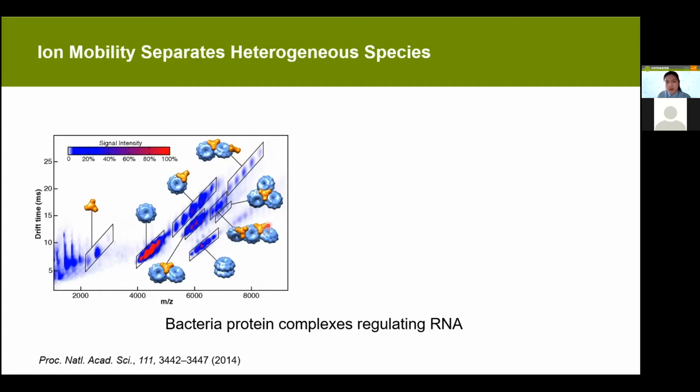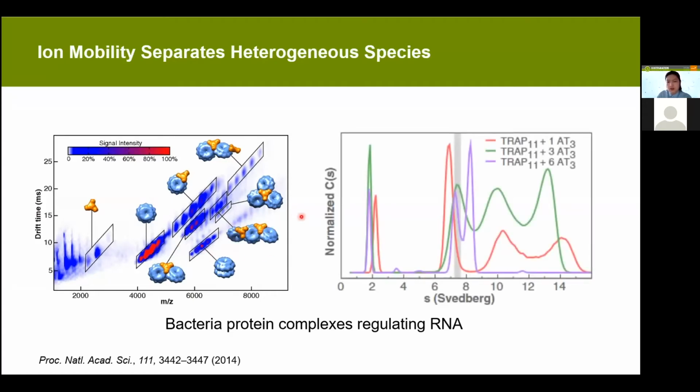And this helps us to build models. And this eventually will help us explain the ultracentrifugation data a lot more easily, because we have these species in the whole assembly. So it helps us to fit the data and understand how those two proteins interact and assemble in this mixture.